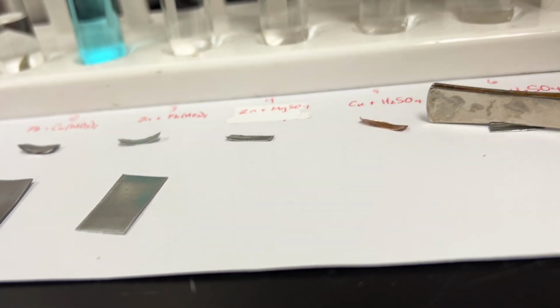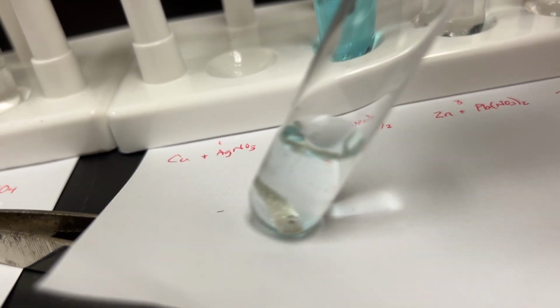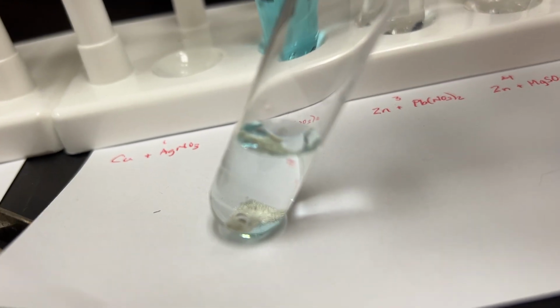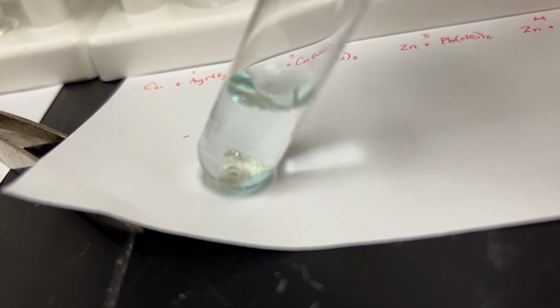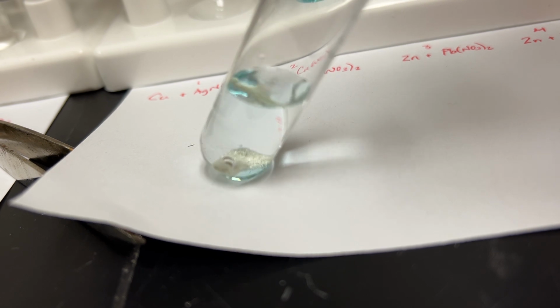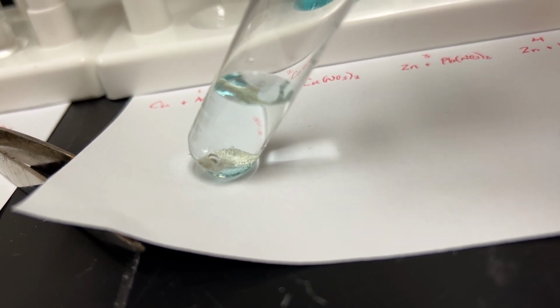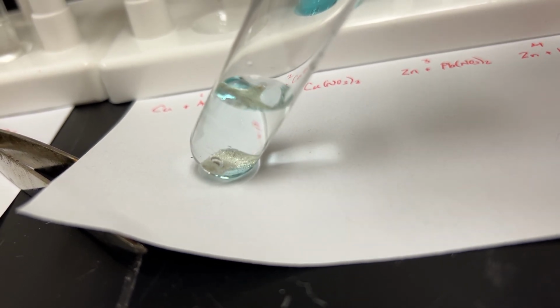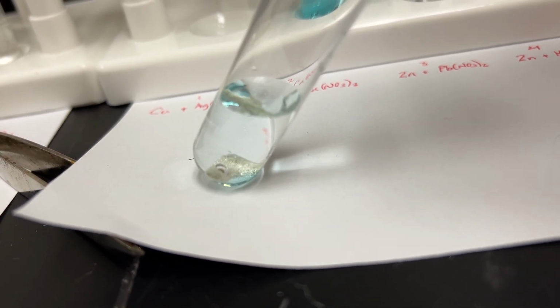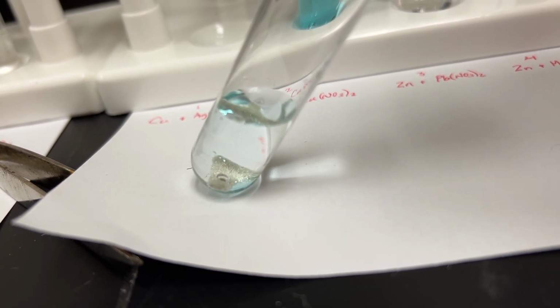And I put this one in a little while ago. You can see there are bright, shiny crystals, and also the solution, which was originally clear, is starting to take on a bluish color. So this is the copper and the silver nitrate producing these little crystals. Now it's up to you to figure out what the crystals are, what's making the solution blue, and which element is more reactive. Is the copper more reactive than the silver, or is the silver more reactive than the copper?